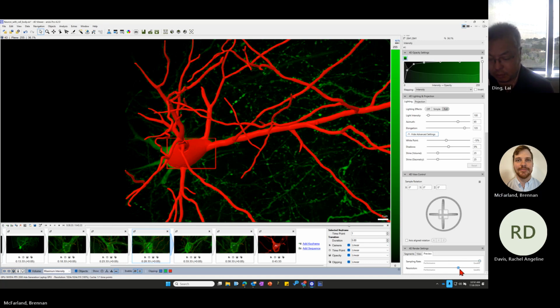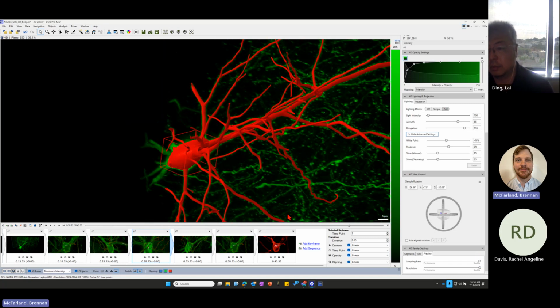And then this for a preview would be reflected in how we show these examples. If we were to play the movie before exporting, this will be attached to our data here.